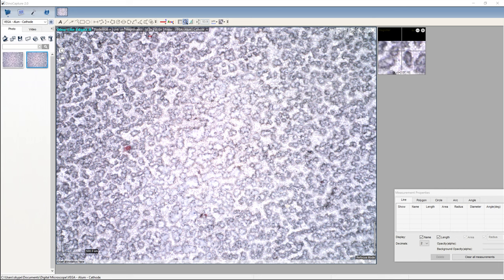And we are looking at this at around about 56 times magnification. They're quite large, and they're spaced and discrete, largely, although there are some that are merged into each other, of course. Got like a zigzag down here.